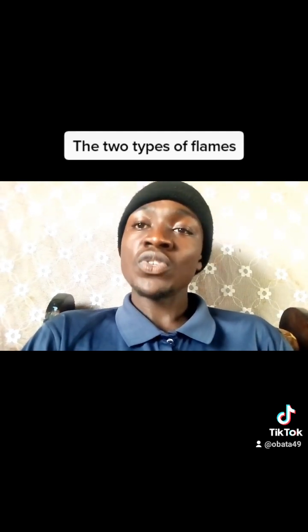Why is the other flame, the luminous, not preferred for heating? It is because it produces a lot of soot, which dirties the apparatus, and it also produces less heat. Those are the two things that you should be aware of.